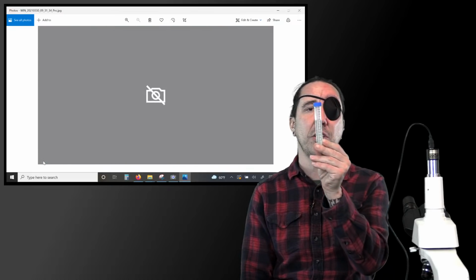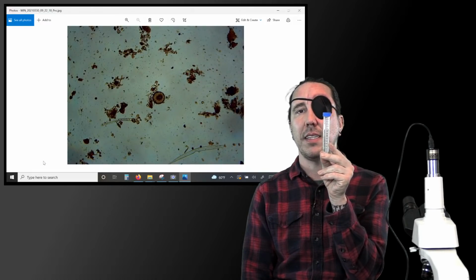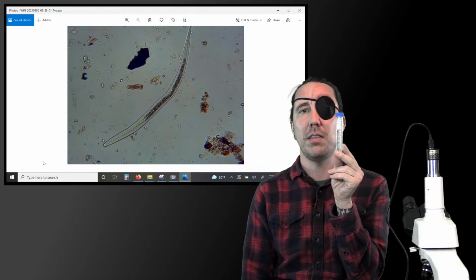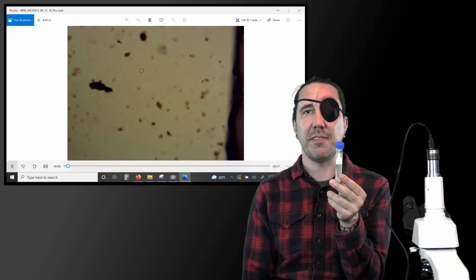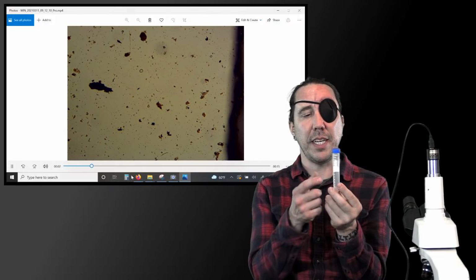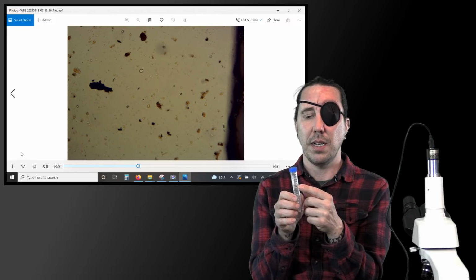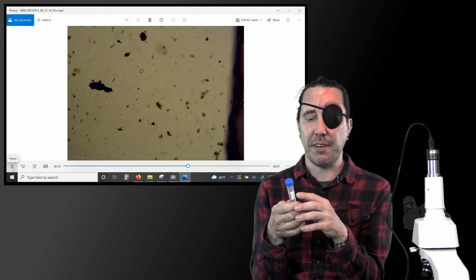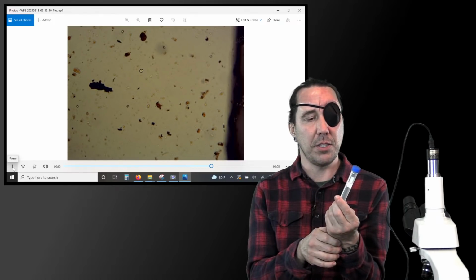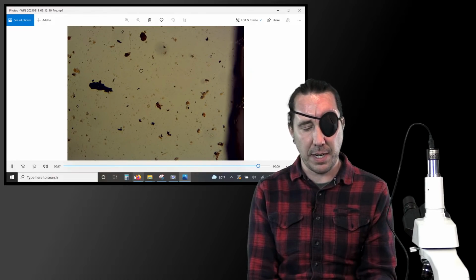As far as centrifuge tubes go, it's really hard to purchase these in small quantities. You generally have to purchase like 30 packs, 50 packs, 100 packs, but these are 15 mil centrifuge tubes. We're only using 10 of that, but I haven't ever found just 10. But any laboratory or scientific supply is going to have those.